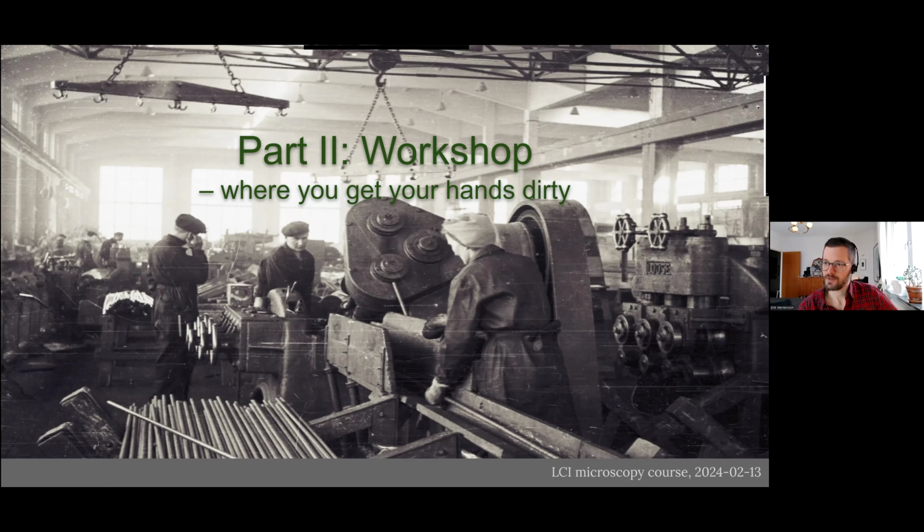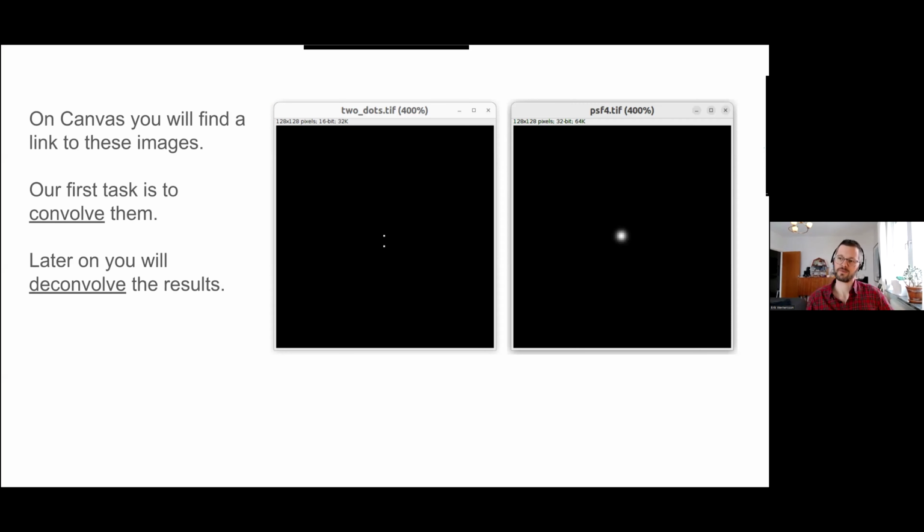I thought that we should start with not deconvolution, but convolution, the opposite. And I prepared a few small images for you. There's a link on Canvas. And your first task will be to convolve them.